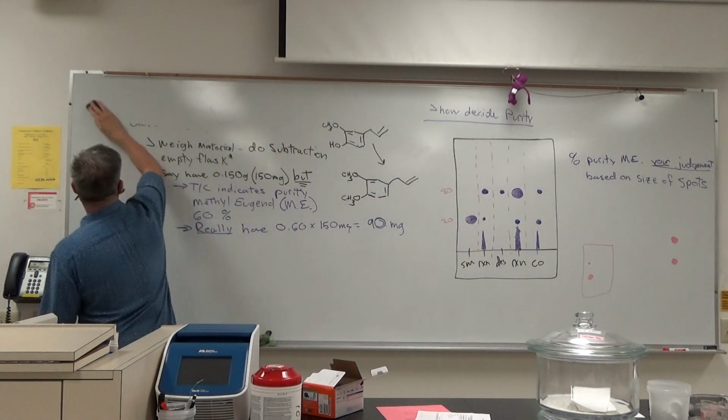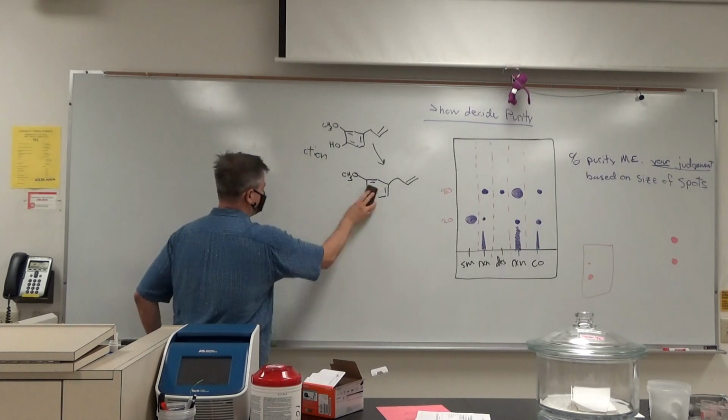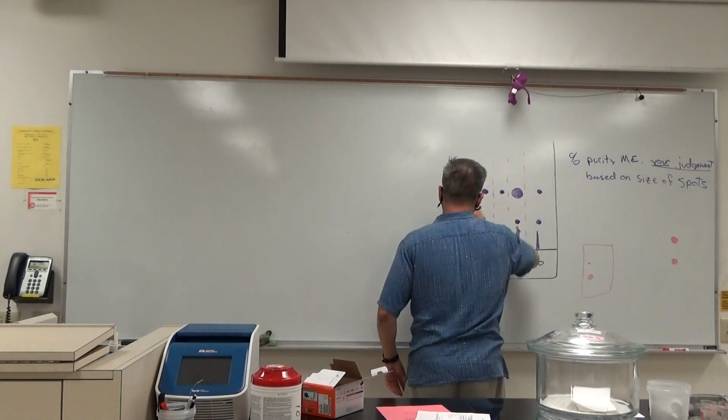From there, you're going to do 2 calculations so that you can set up your trap. I want to make sure that you're comfortable doing that concentration.